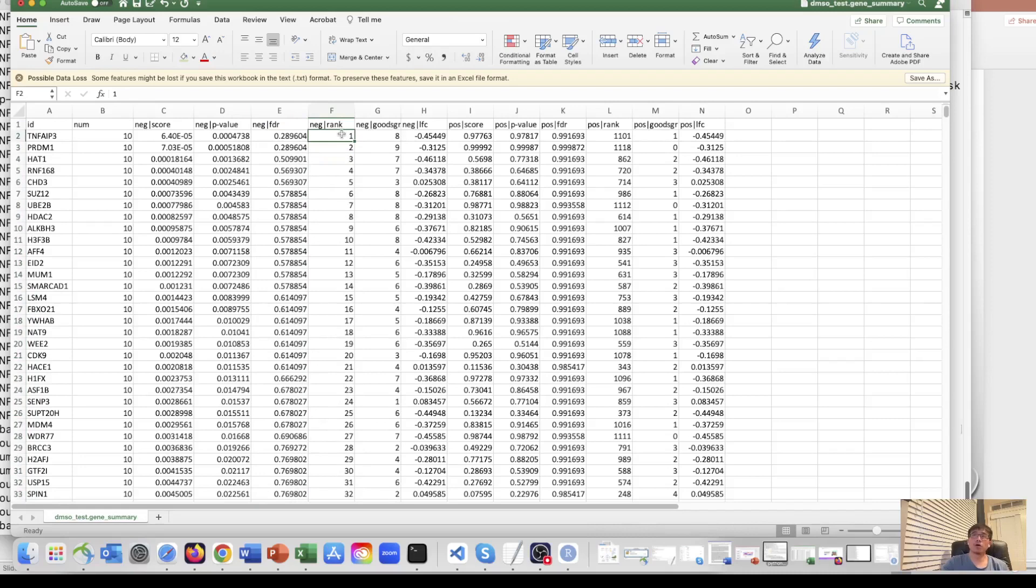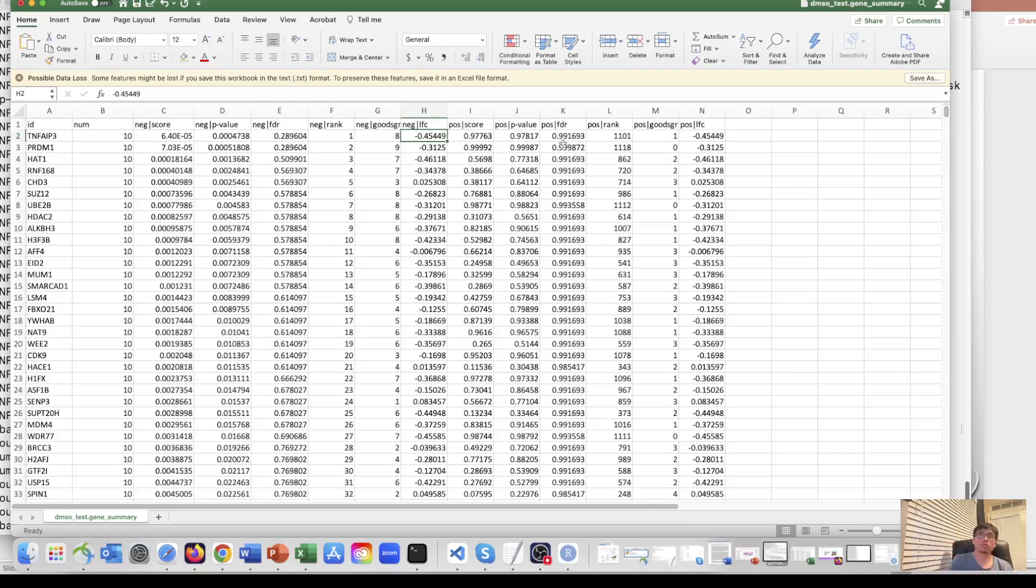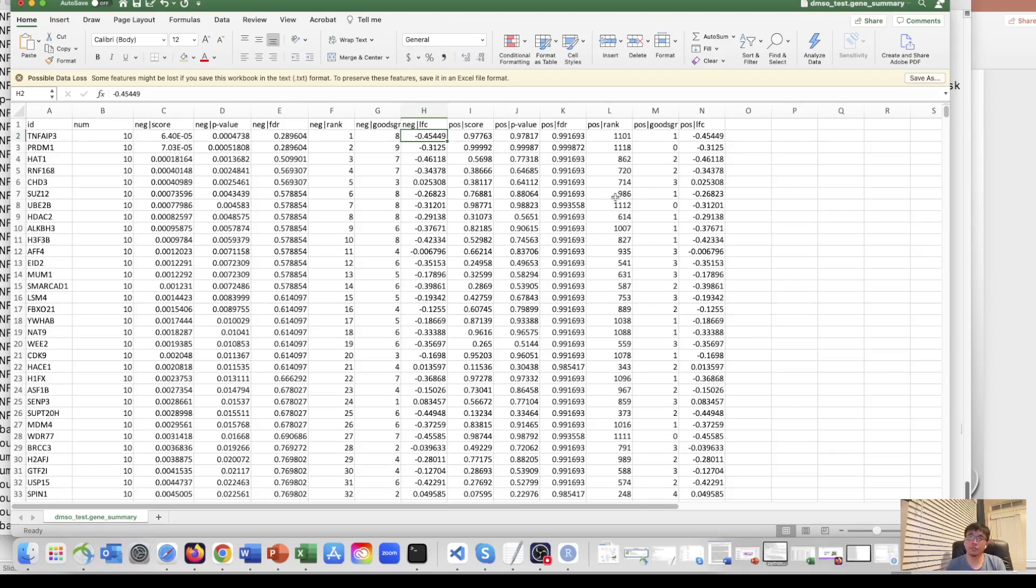So also it has the positive score. So this for positive selection. So it's bi-directional. You can select the top ones with negative selection and top one with positive selection to see what are these. And these are the gene hits you need to further validate.